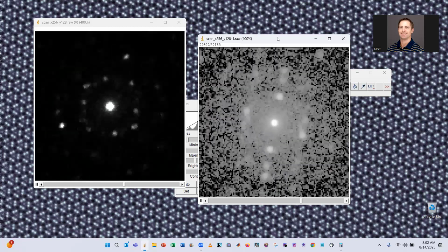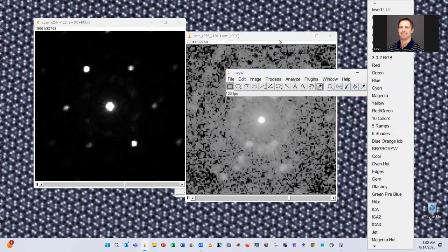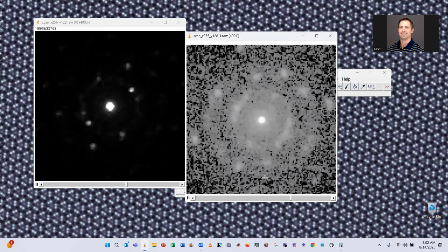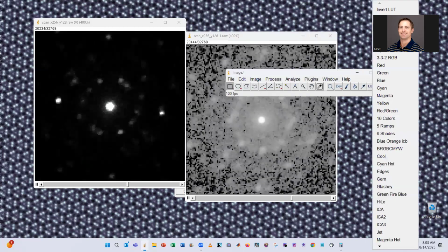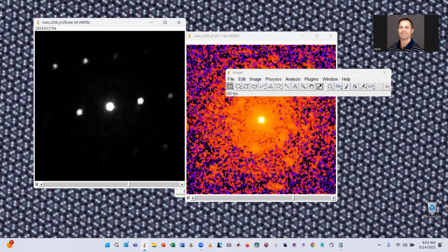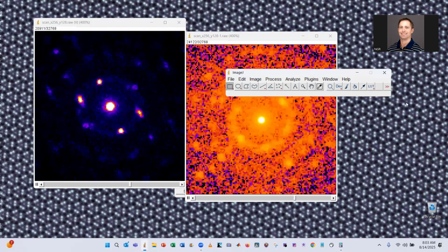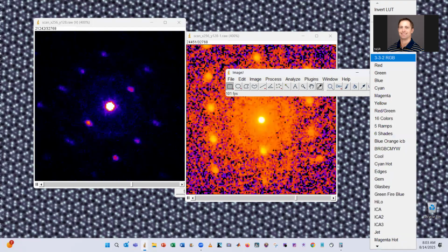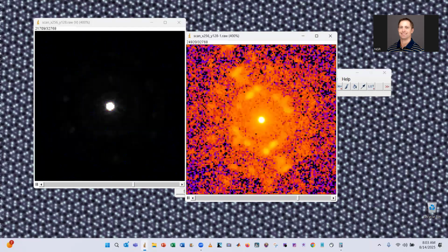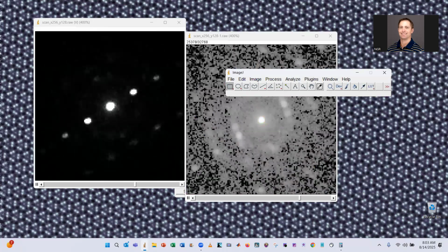Okay. And actually, just for fun here, I think with Zoom it may not be showing this as fast as I'm seeing it right now, so I apologize for that. Yeah, if you add a lookup table here, neat. We'll do grays. And let me stop this.